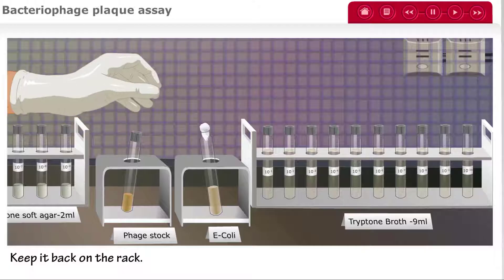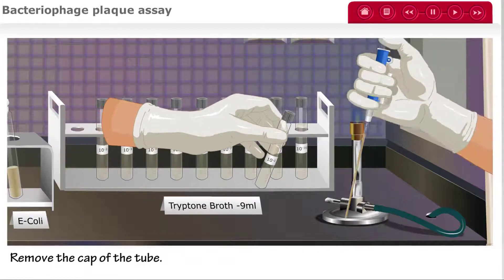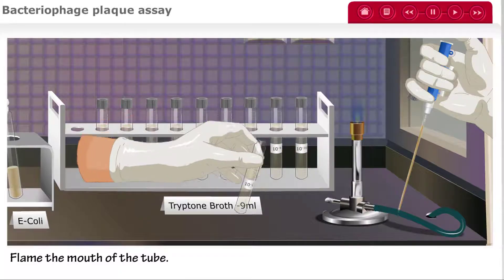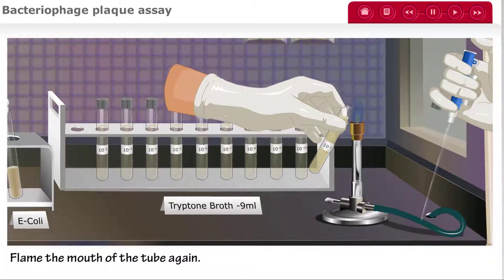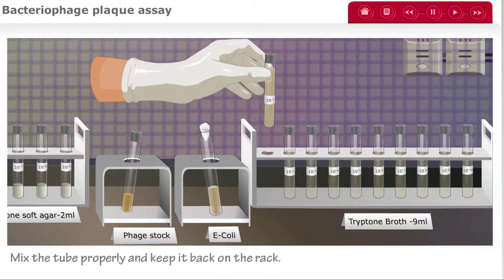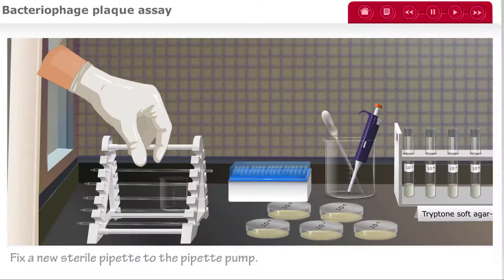Take the tryptone broth tube marked 10 to the negative 1. Remove the cap and flame the mouth of the tube in the blue flame of the Bunsen burner. Transfer 1 mL of the culture from the pipette into the tube. Flame the mouth of the tube once again and replace the cap. Mix the tube properly before placing it back on the rack, then remove the used pipette and dispose of it properly.